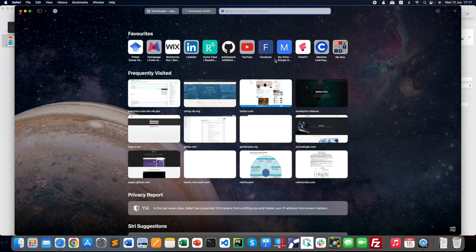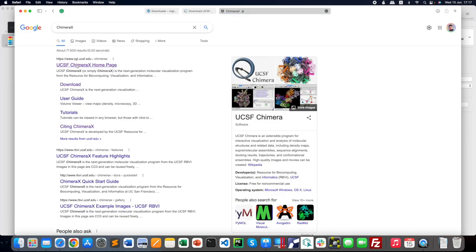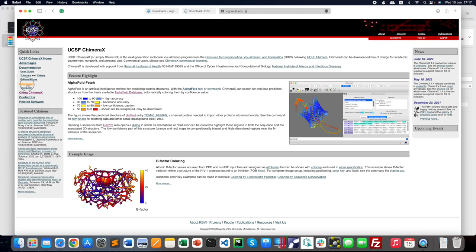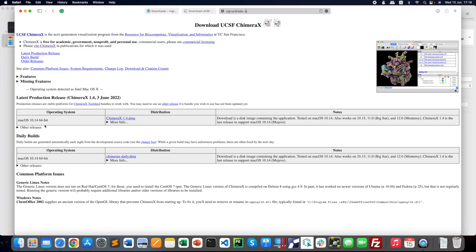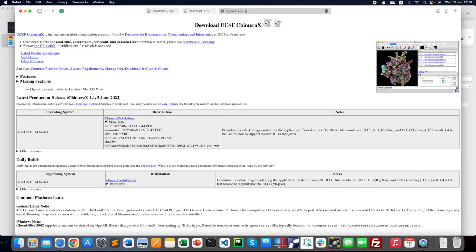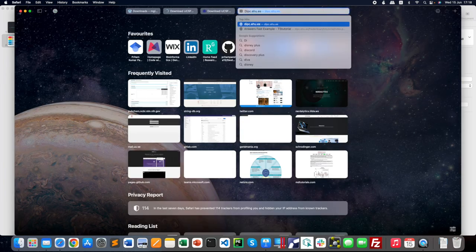The next software required is ChimeraX. Go to the ChimeraX page and click Download—the latest version, which is version 1.4, is available for Mac OS and Windows as well. This can be downloaded and used for visualization and interpretation of different types of interactions like protein-ligand interactions and surface views. This software is very important and I'll show how to use ChimeraX in other series videos.